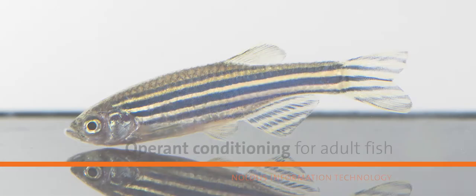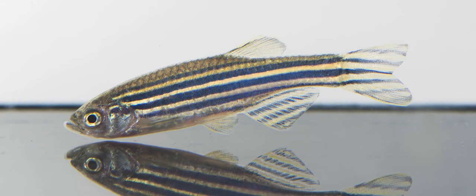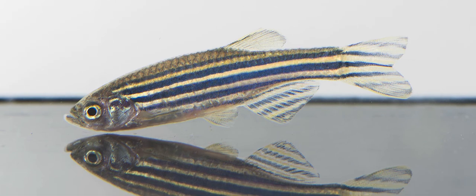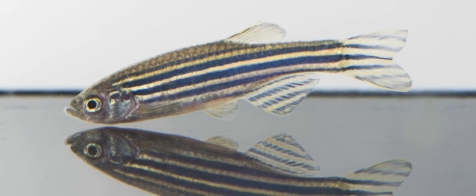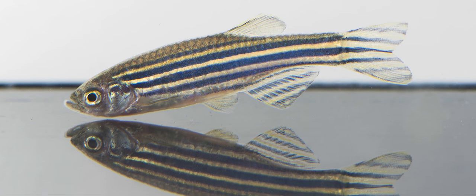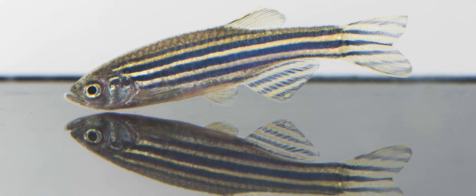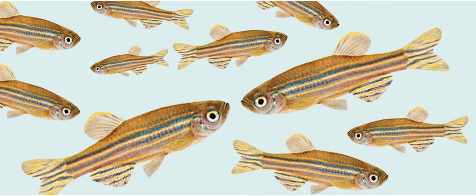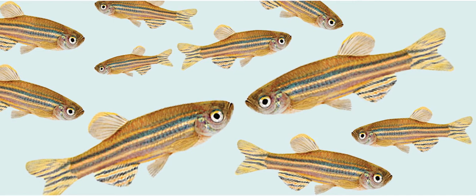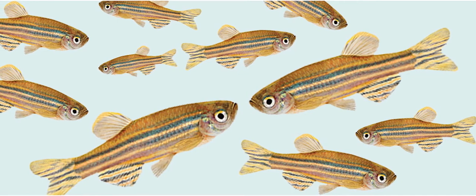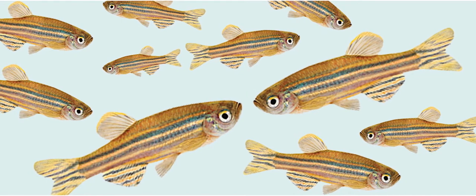The zebrafish model is increasingly important in the field of behavioral neuroscience. Handling and social isolation produce stress, which has a negative effect on your animals and your experiment.